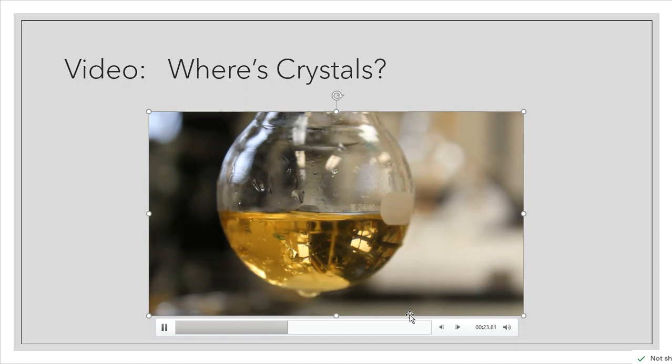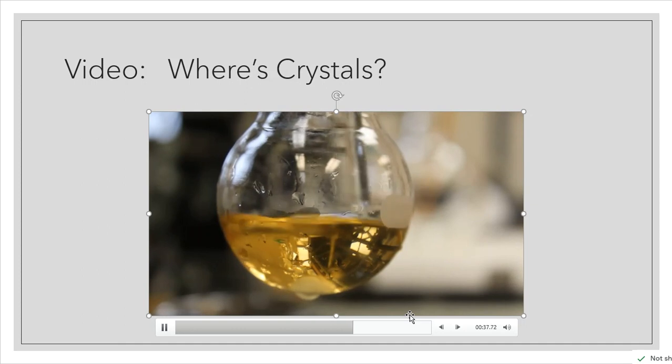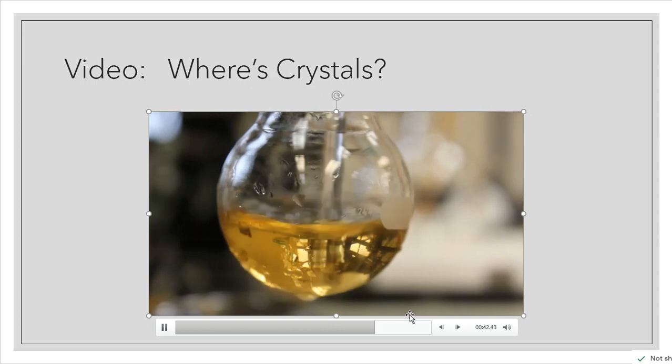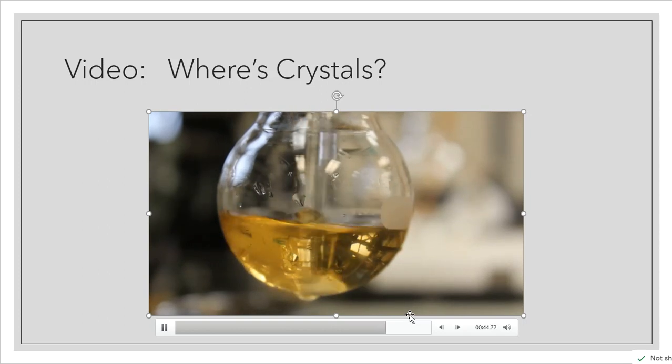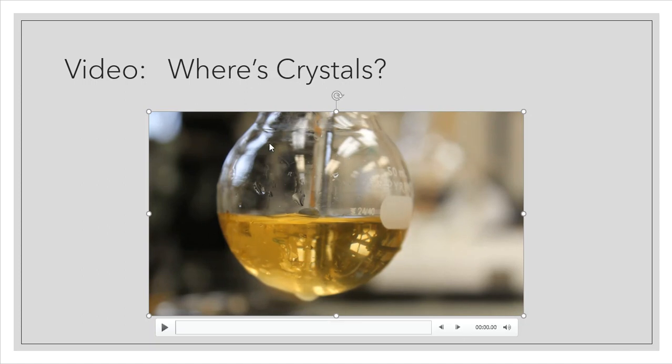So the directions tell me to take something like a glass stirring rod, and that's what you're seeing here. I'm gonna put it in the solution, and it tells me to scratch the inside of the flask. So I'm just going to take the stirring rod and give it a couple of jiggles and just scrape the sides of the glass to see if I can help promote the recrystallization, or really the crystallization, of my product here. So that's what I'm going to continue to do. It might take a few minutes, and then I'll show you what this looks like after that process is finished.